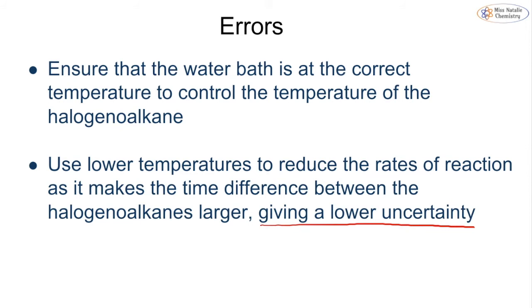It's not quite room temperature, but it's not boiling and it's not too warm. It's just a nice warm temperature to allow the rate of reaction to happen at a suitable time, but there's still a big enough difference between our different halogenoalkanes to see the reaction.